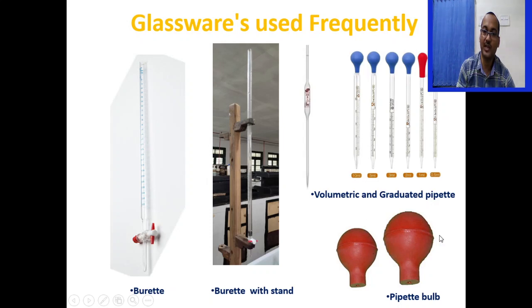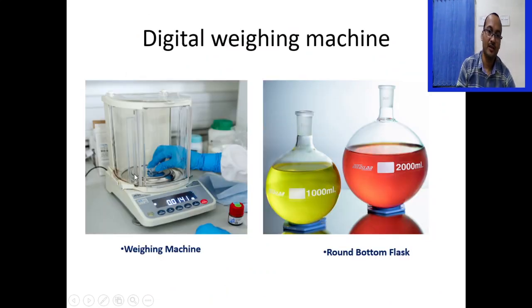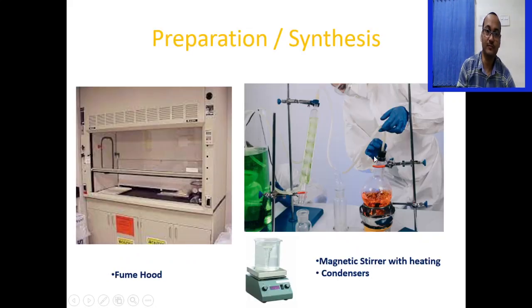The digital weighing machine is used to take the exact weight of different chemicals. The round bottom flask is used to carry out different reactions. During preparation or synthesis, you will mostly use a fume hood with different regulators for air, oxygen, and nitrogen. This is essentially a small lab where you can carry out all your reactions safely. The magnetic stirrer with heating system and condenser are also needed for preparation or synthesis.